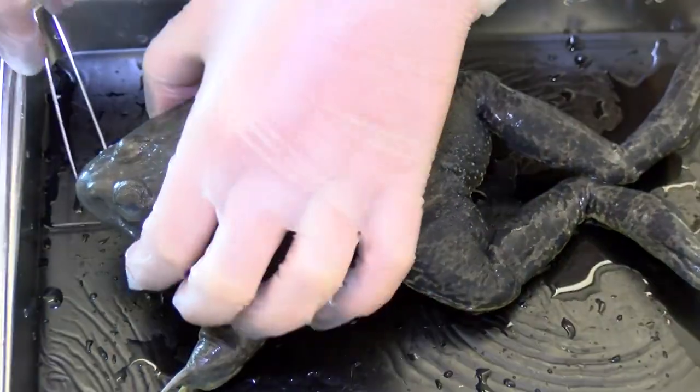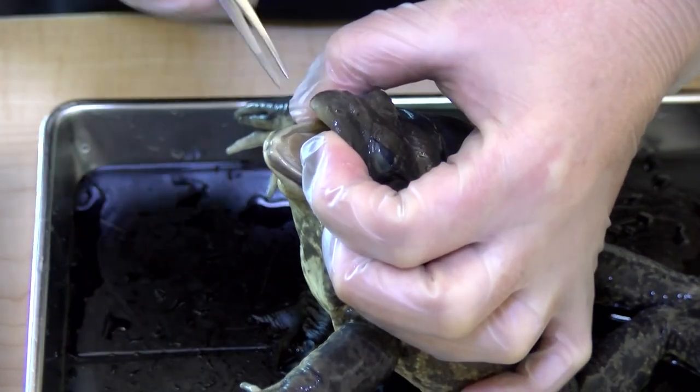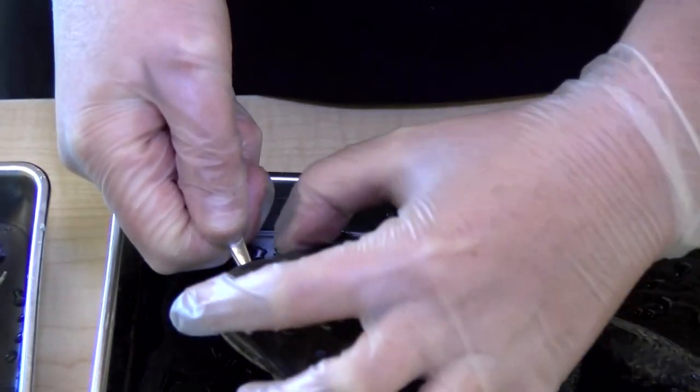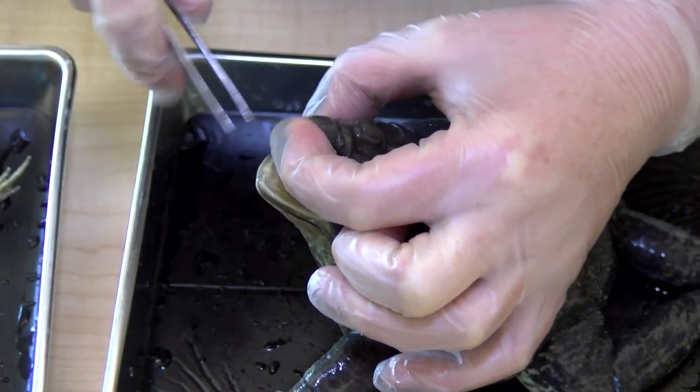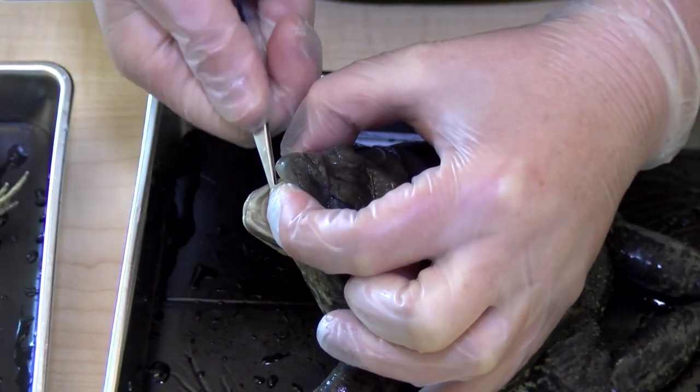One of the really cool things about a frog is that their tongue is connected at the front of their mouth. Ours are connected at the back, but a frog's tongue is connected right at the front so that it can flip out to catch flies or different things that it's going to eat. It flips out and then retracts back in so it can eat.